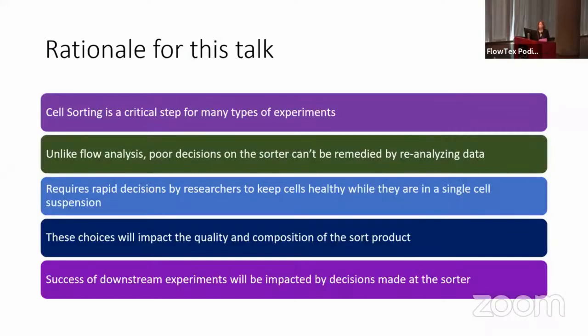So the rationale for this is that sorting is critical in lots of different kinds of experiments. You'd be amazed by the number of types of experiments and papers that get published where sorting was done but does not appear in the methods. It's a very common technique and required for all kinds of different things. It has a time pressure component though.